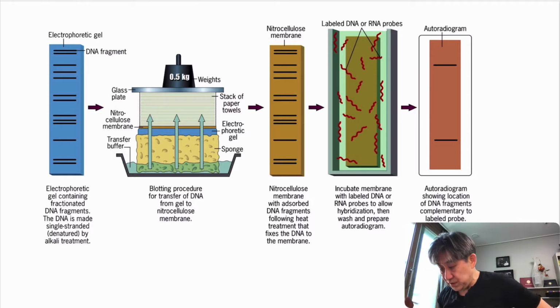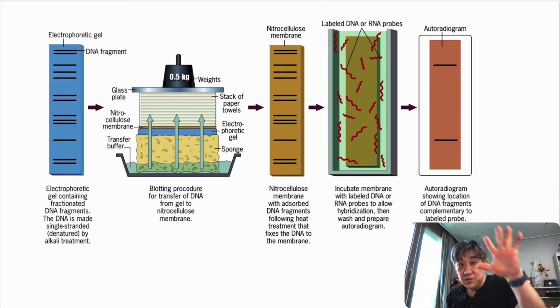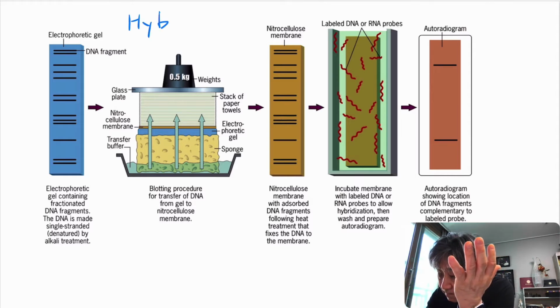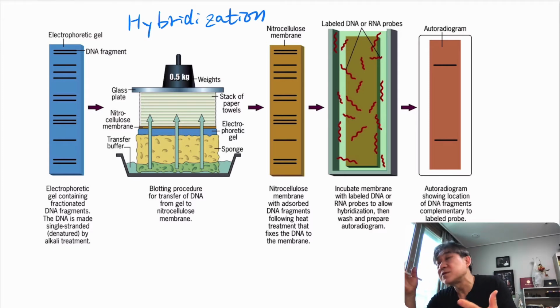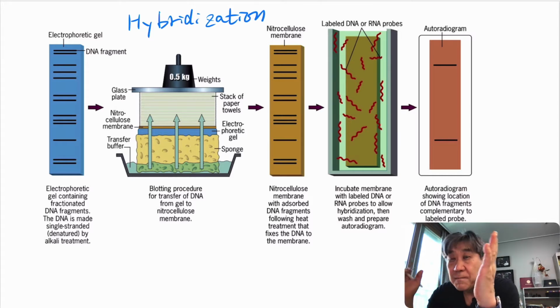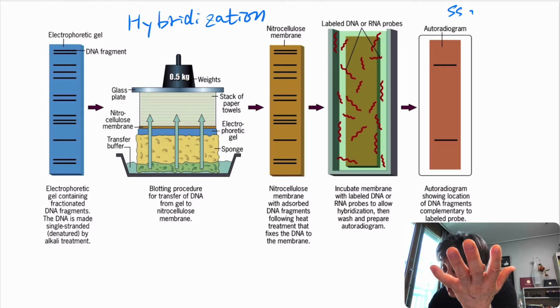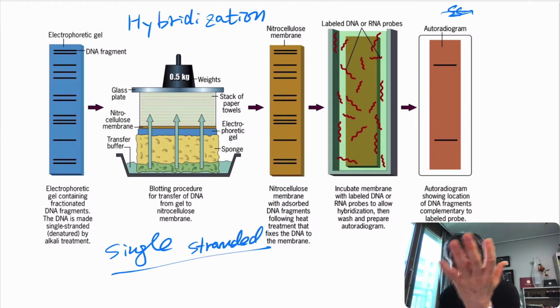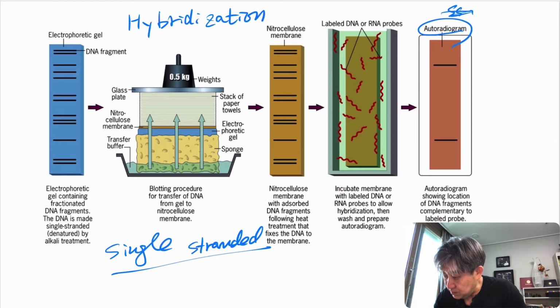These different techniques I will skip, although it is a big part of how, in practice, once you complete the gel electrophoresis, you actually generate your DNA sample and convert it into single-stranded DNA so that it is ready for hybridization. Hybridization means interacting your target DNA sample with the probe, with both of them in the single-stranded state, so that they have the opportunity for complementary base pairing, and then finally you can detect whether they have it or not.